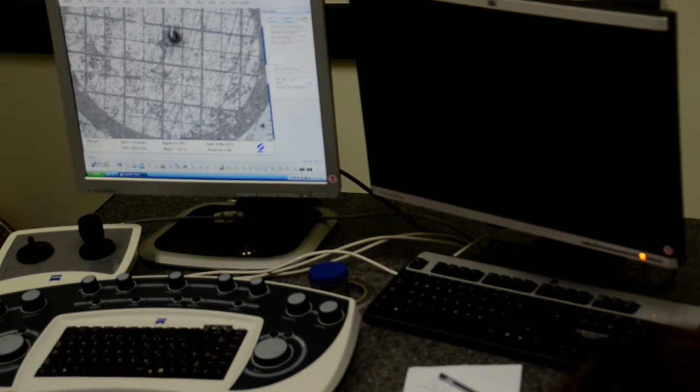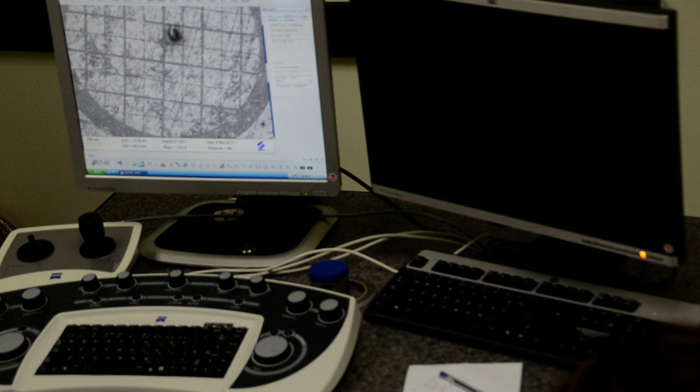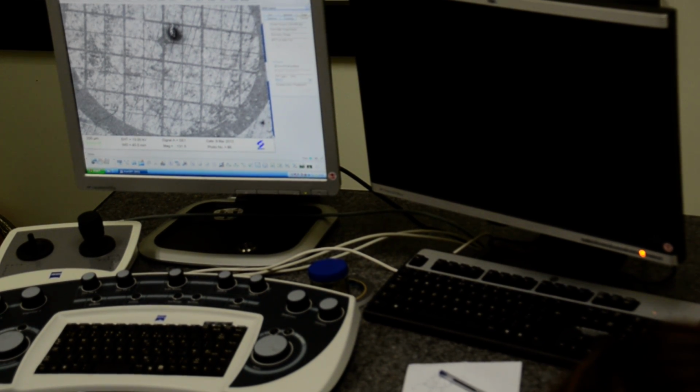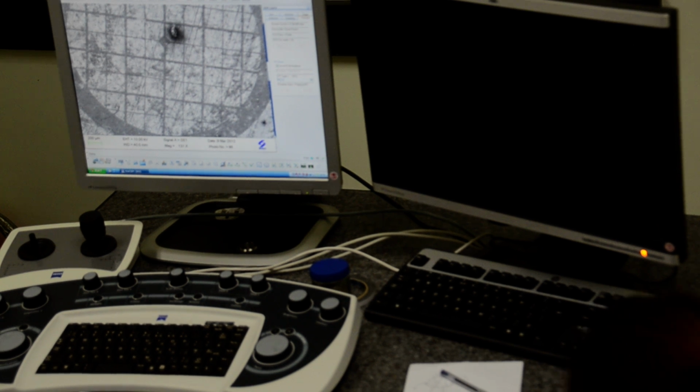Because from time to time if you're dealing with a particular sample of typical size, you can make your own one, which fits the sample better. You need this one. That's all. The rest of it is aluminum stuff. Because from time to time your customer sometimes customizes this kind of sample holder.